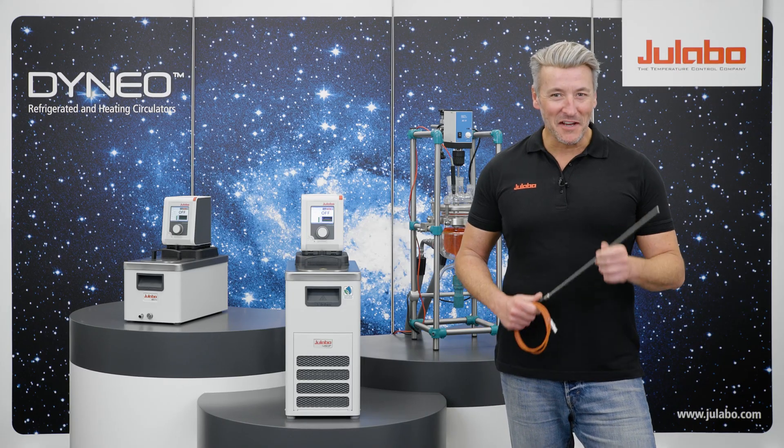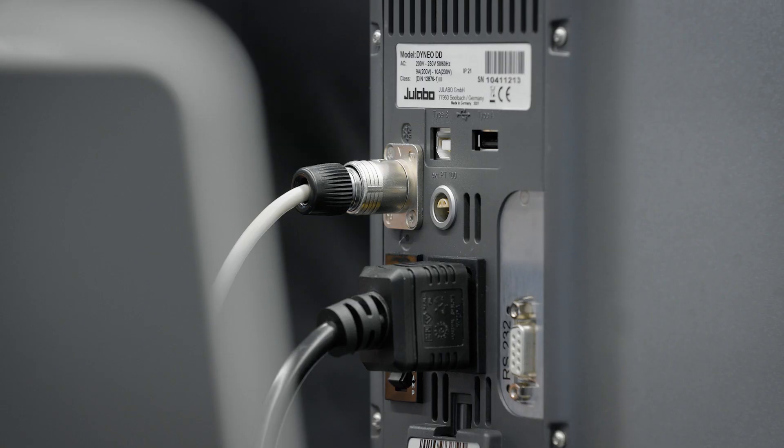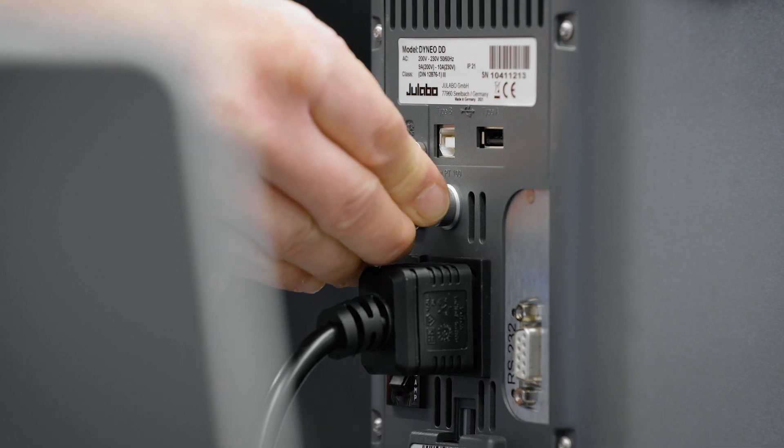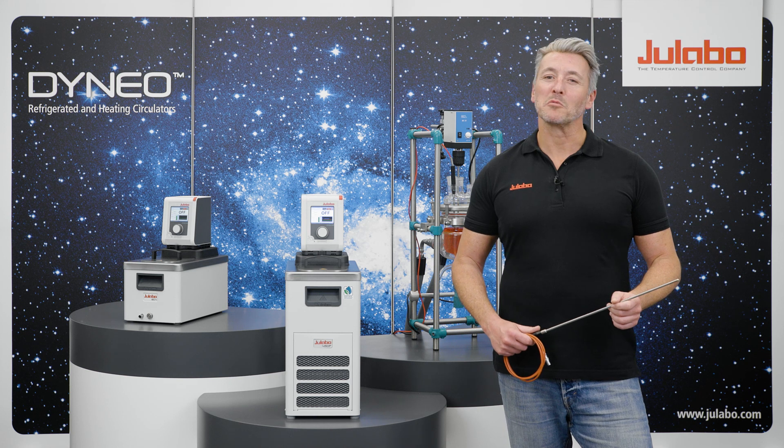Finally, don't forget to connect the external temperature sensor, like this PT100. Among your lab's portfolio of accessories you can find many options for PT100 sensors.